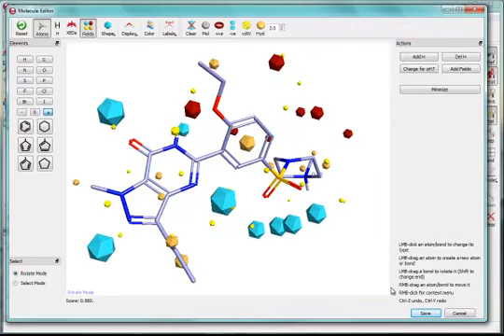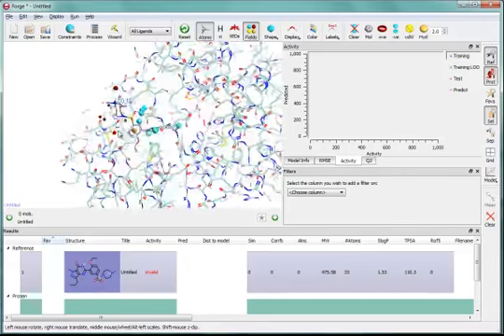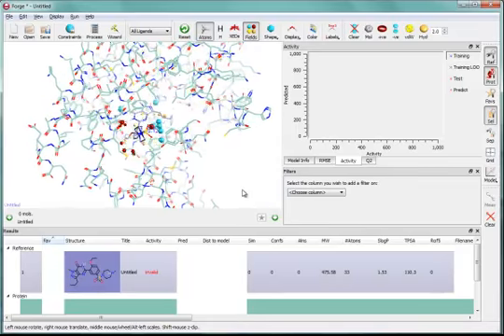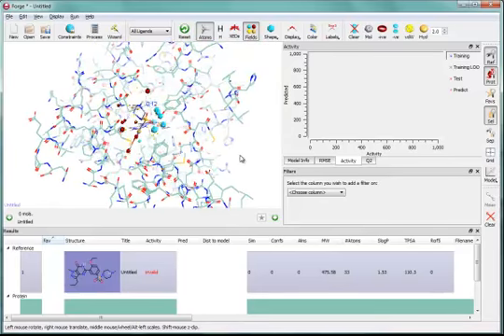Okay, that's looking really nice, so let's just save that back into our project. So now I'm all set up, I've read my PDB file, I'm set up to load some more molecules and do some alignments, and then process those to the SAR or to design some new compounds.